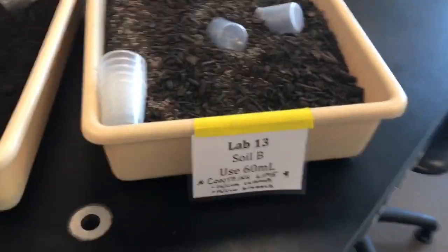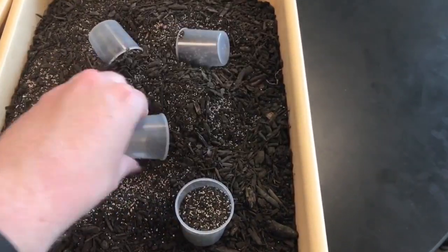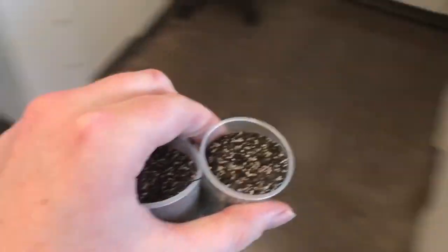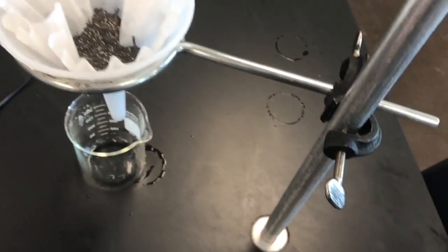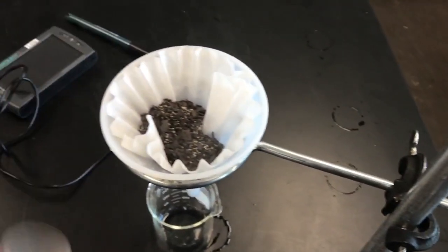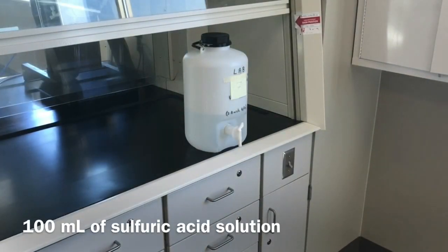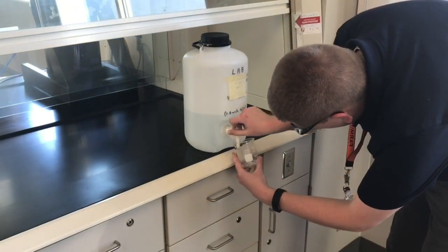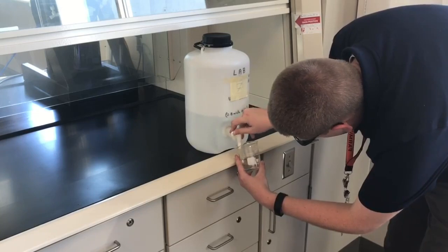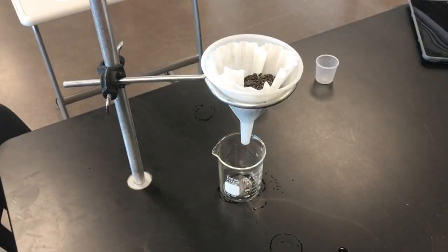And we're going to grab 2 scoops of soil B. I'll put those in right away. So we got soil B. All right, I'm going to grab another 100 milliliters of our sulfuric acid solution. All right, everything seems to be in order here.